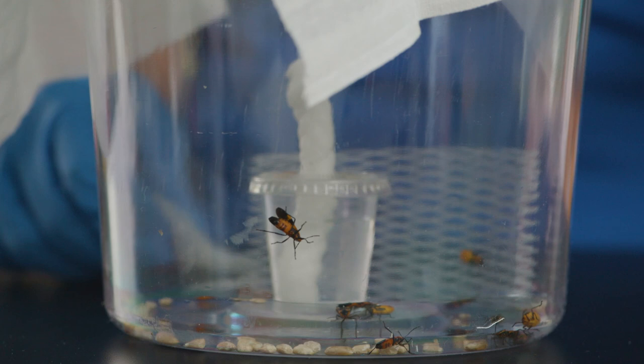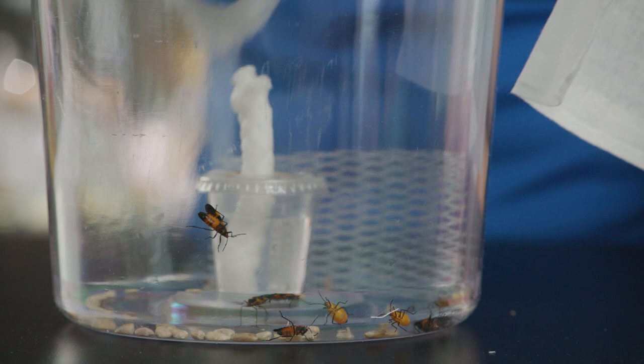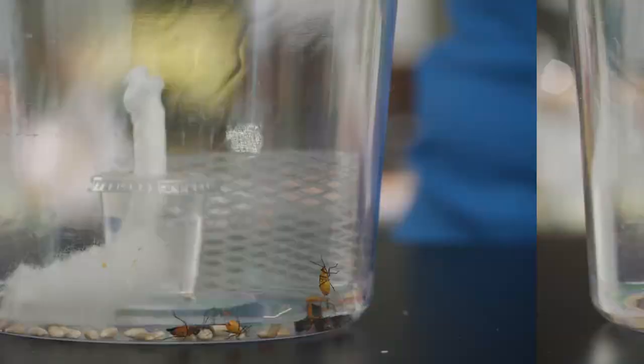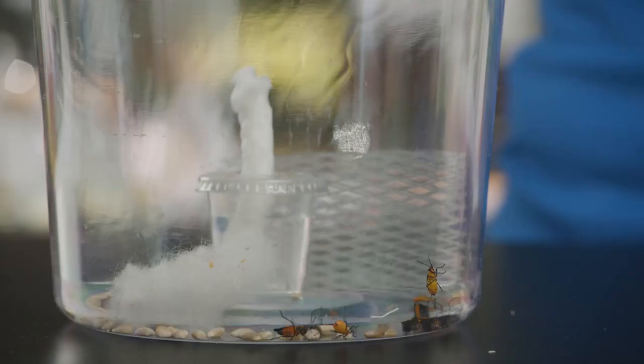The adult milkweed bugs will eat the eggs. To avoid this, remove the cotton daily and place it in a separate jar or container and replace it with unused cotton.